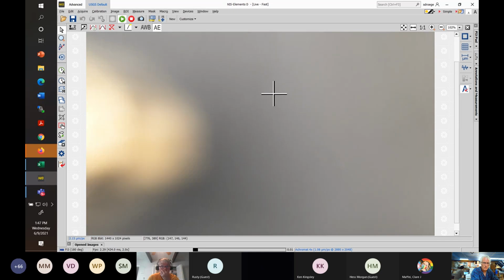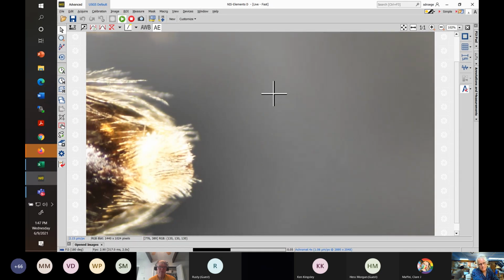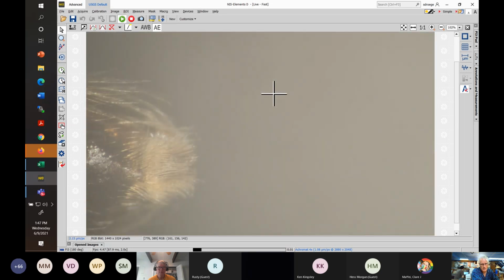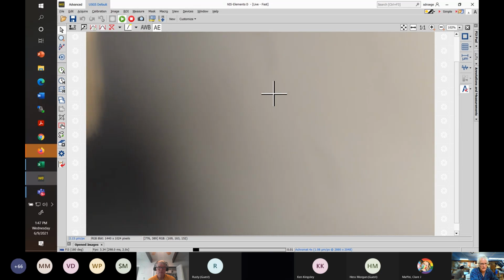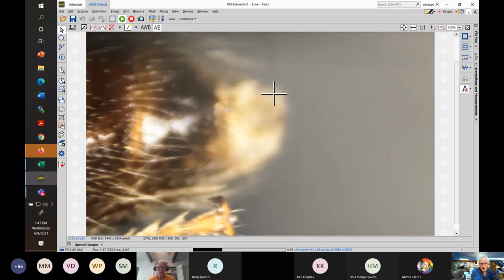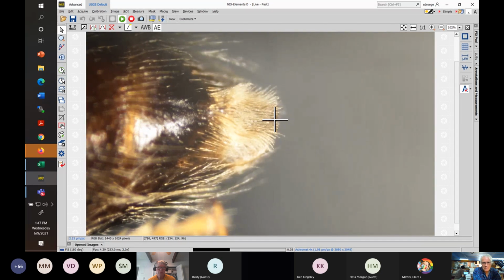So I'm going to bring it over, and I'm not going to spend too much time here. There's a lot of hair, which sometimes there is in the area, and like a lot of these kinds of things, I can probably find S8 if I start looking at a lot of different views of the same area, and sometimes the hairs occlude it. So I'm not going to spend too much time on this. This is going to be S8 in that area, but again, difficult to see in all the hairiness going on here.